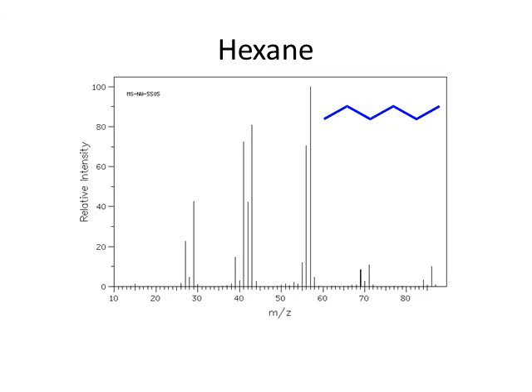Alright, let's just look at a couple of molecules. I won't go through all these molecules in great detail, I just want to point out a couple of features. Here's the mass spec for hexane. Hexane is C6H14. If you had all carbon-12s, C6H14 would weigh 86. And here we see the molecular ion peak. That's for 6 times 12 plus 14. You also see a little blip here. That's for C6H14 where one of the carbons is carbon-13. That's the M plus 1 peak.